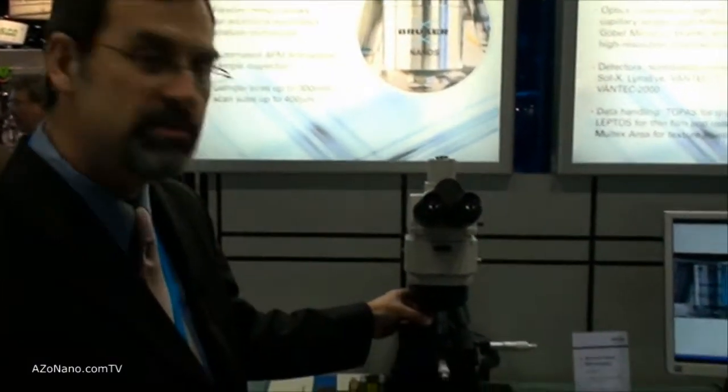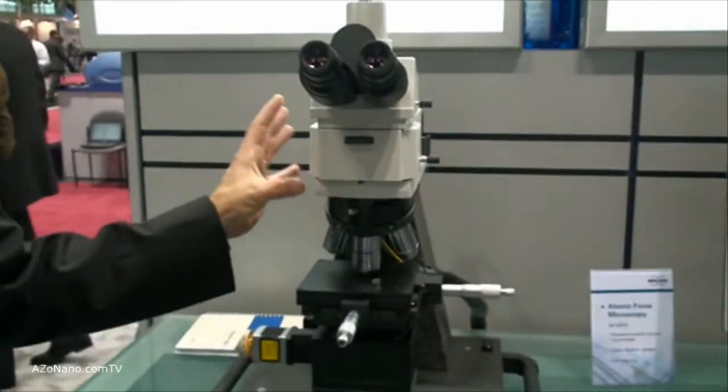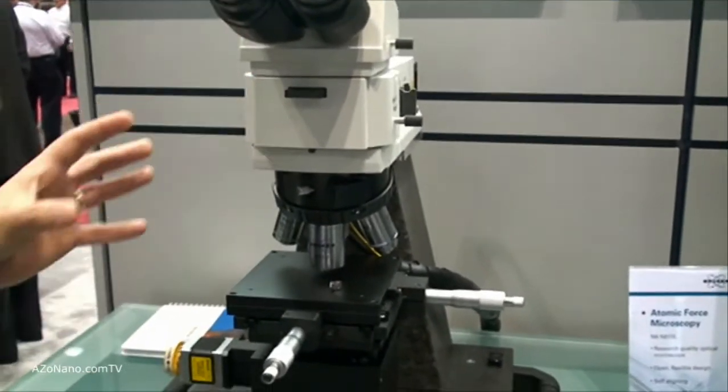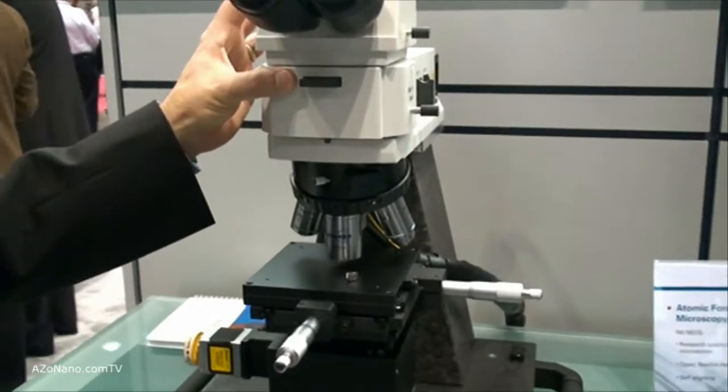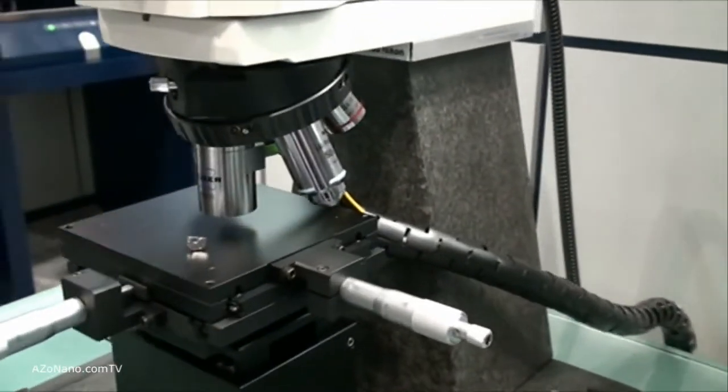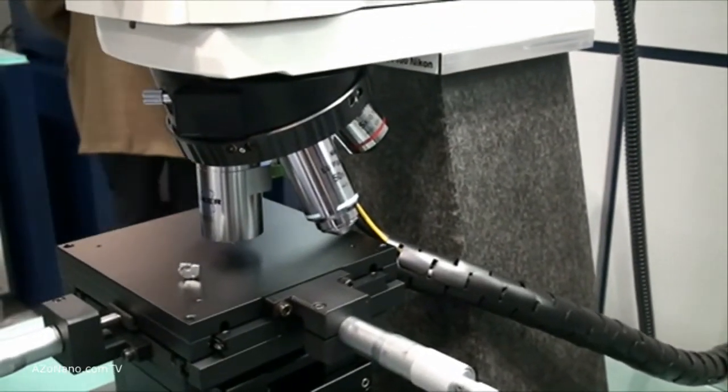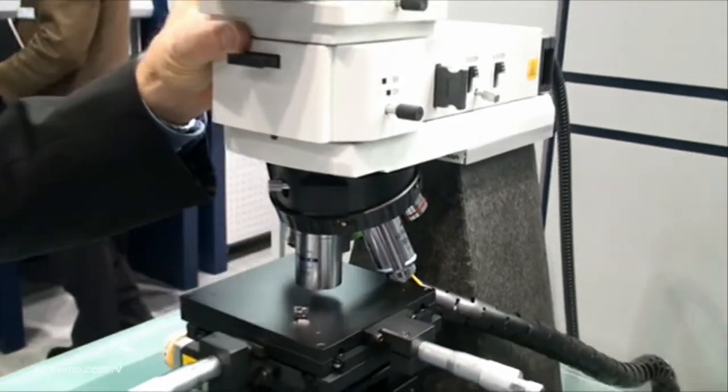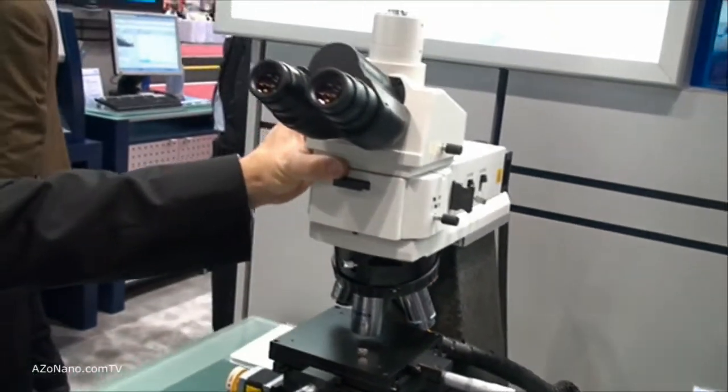We use the objective form factor and mount it on an optical microscope. So now you have a research quality optical microscope with bright field, dark field, NAMARSKI DIC objectives. Anything that you want to put into an optical microscope, we can build into your AFM.